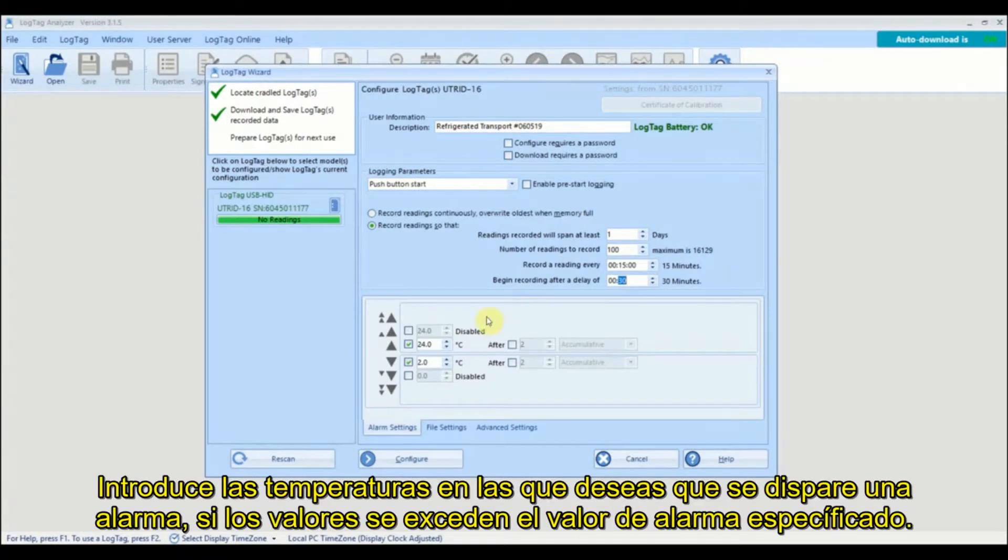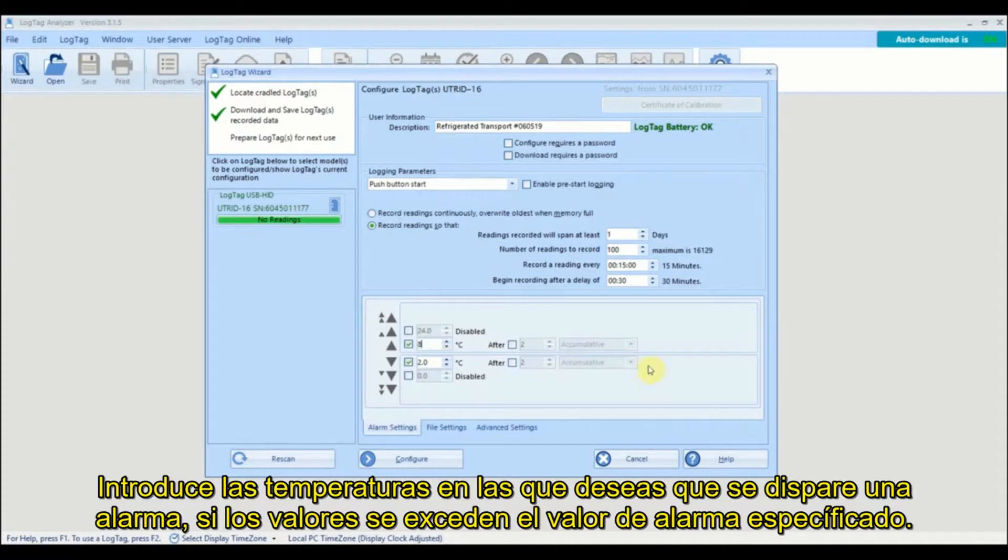Enter in the temperature values that will trigger an alarm if readings exceed the specified alarm temperatures.